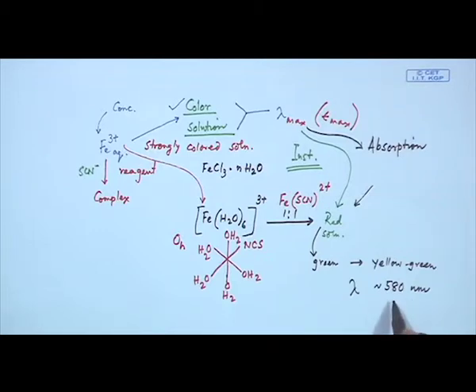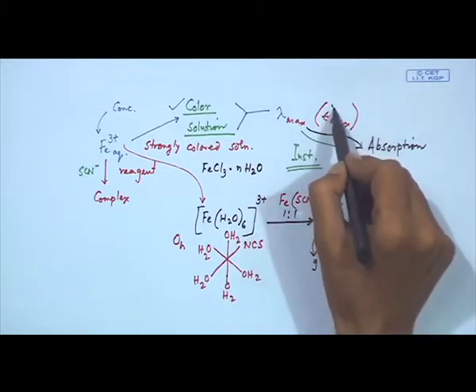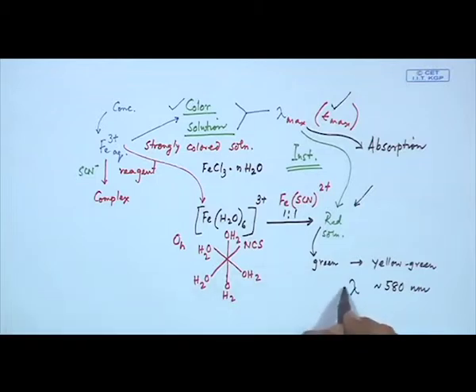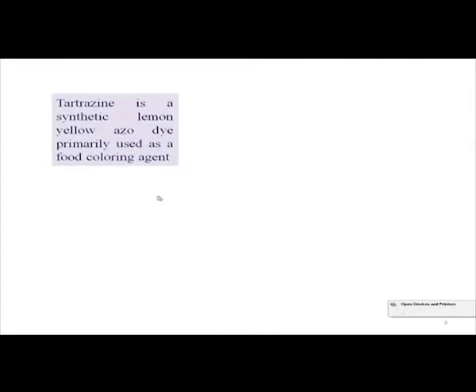You determine that absorption, and how to detect it, that means how much absorption can take place at that particular point, is very simple to know, the corresponding lambda max value. That means, how do you correlate this lambda value to a concentration? And what is that concentration? We are looking for the concentration of Fe3+. So, that is our next goal to establish, once we know the corresponding lambda value, the corresponding concentration.